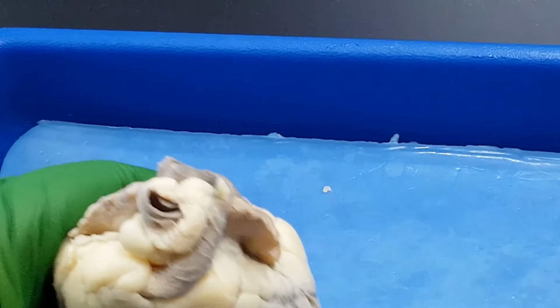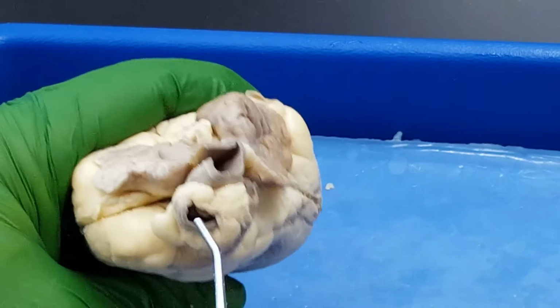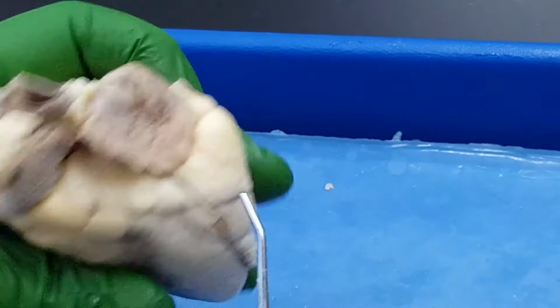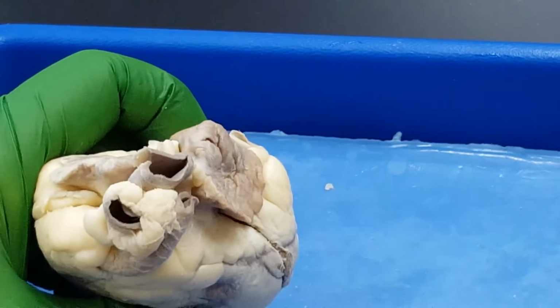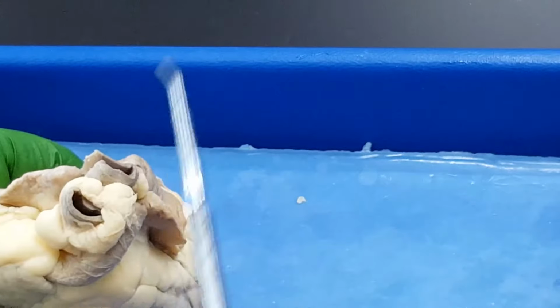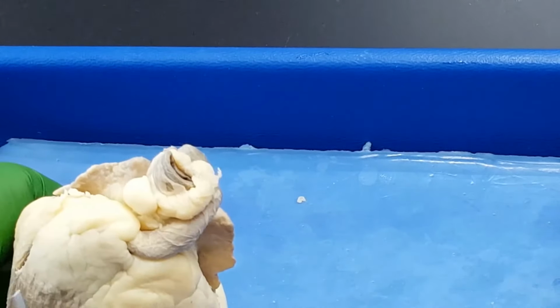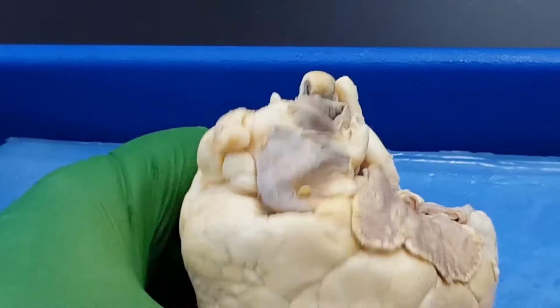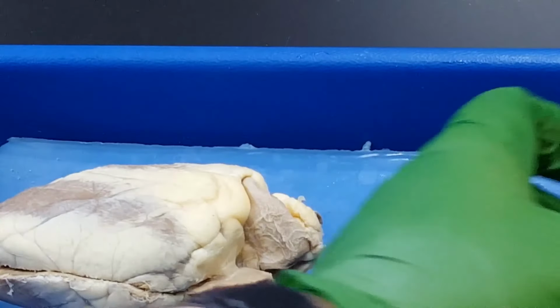Now, I mentioned this before. You can see a couple great vessels, usually pretty easy to see, at the top of this heart, but they cut them off very short. Notice I don't see any aortic arch. I don't see any pulmonary arteries shooting off the pulmonary trunk. And it is so common, this appearance, look at this one, how short it's cut off. No arch, no branching of the pulmonary trunk.